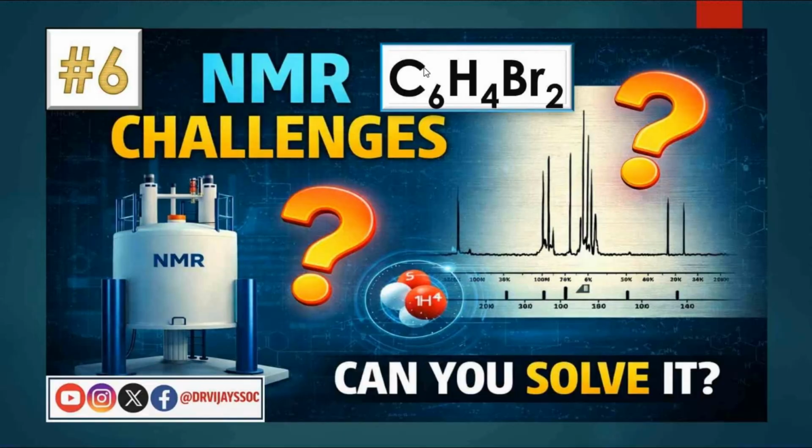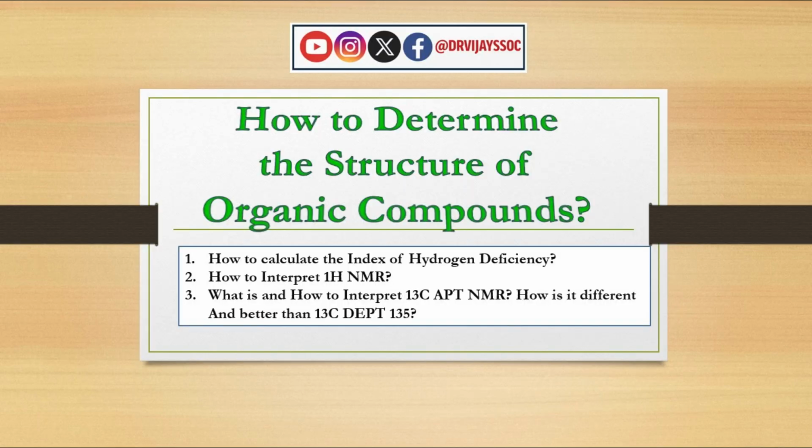So here is our sixth NMR challenge. We are going to determine the structure of this organic compound having molecular formula C6H4Br2 from the given NMR spectra. While determining the structure, we are going to follow all those steps which we learned in the last videos. First we will calculate the index of hydrogen deficiency, then we will look at 1H NMR, and after that we will look at 13C APT NMR.